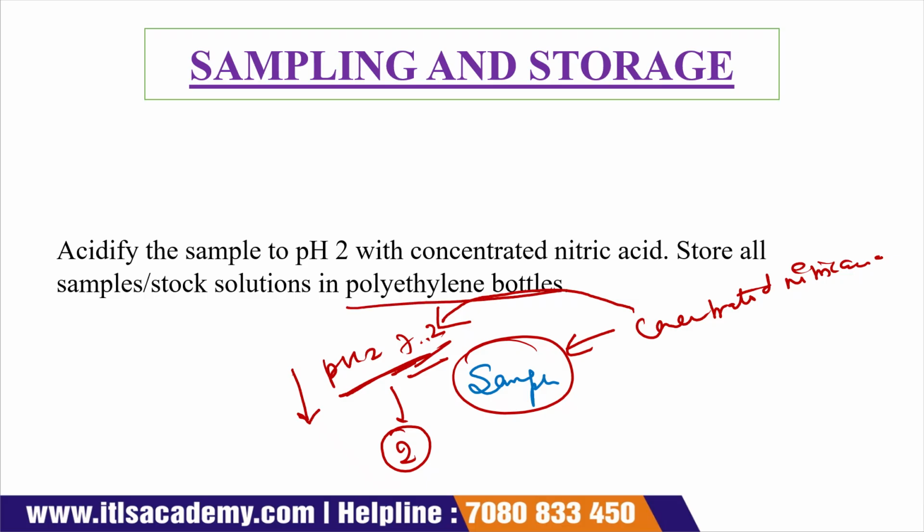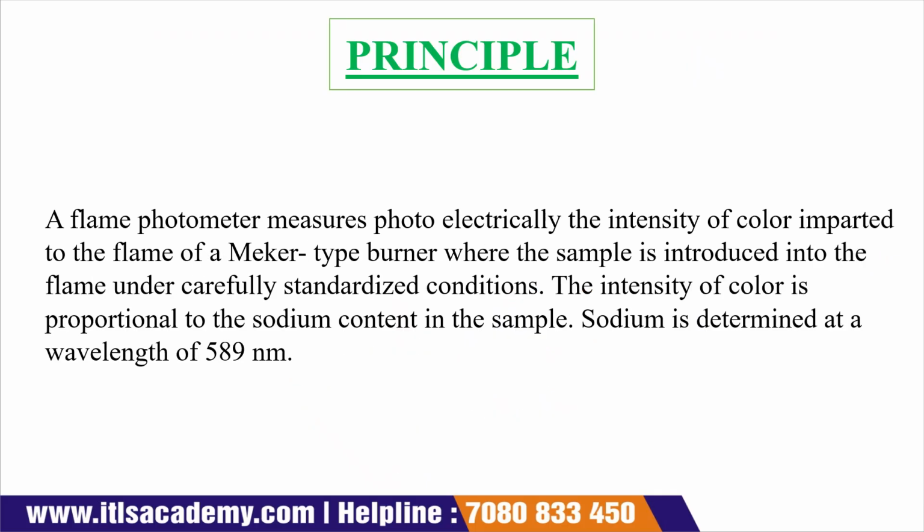Then we store the sample in polyethylene bottles. But before storage, you have to acidify your sample with the help of concentrated nitric acid, until the pH reaches 2. It is very important.